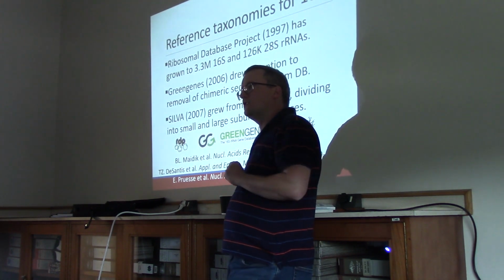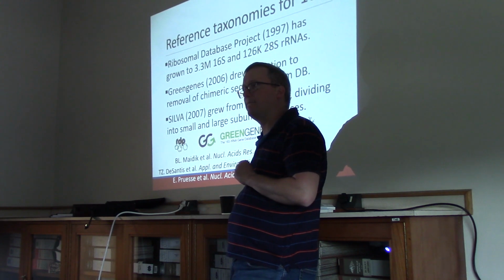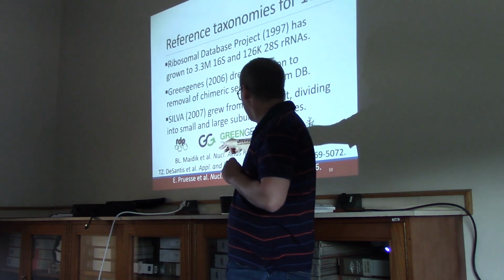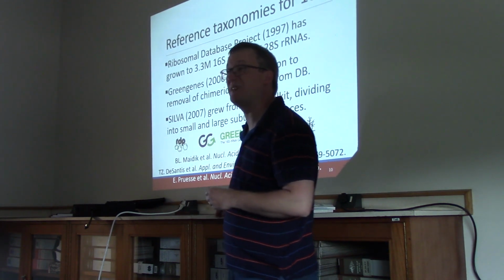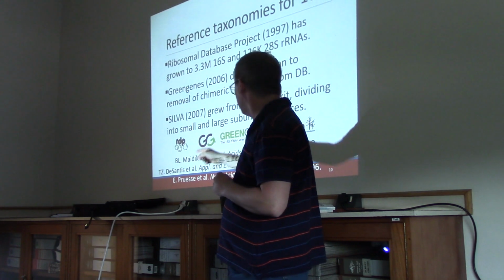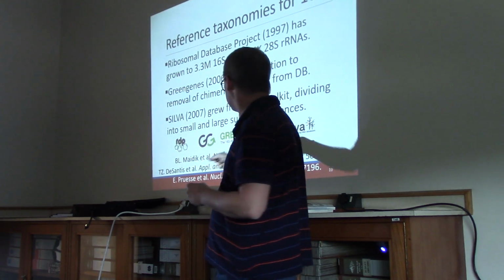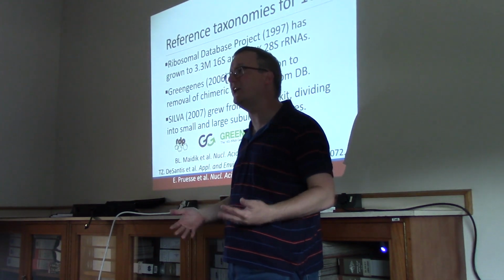So which of these would be valuable if you were going after fungi? Are you going to go after one that says the 16S rRNA toolkit? Probably not. That's bacterial. Now, does that mean GreenGenes has nothing in fungi? It doesn't mean that. It may be that although this is their icon, over the last 2 years, maybe they've really built up their 28S collection.